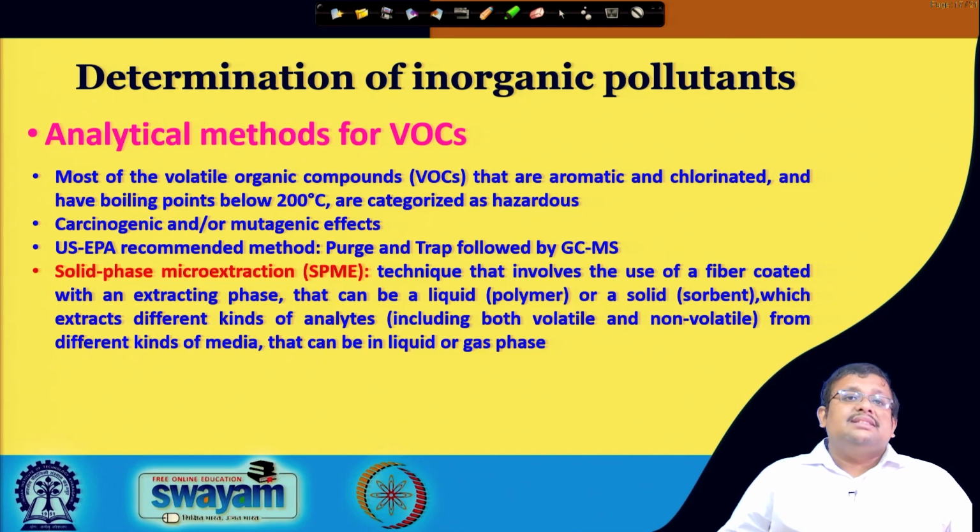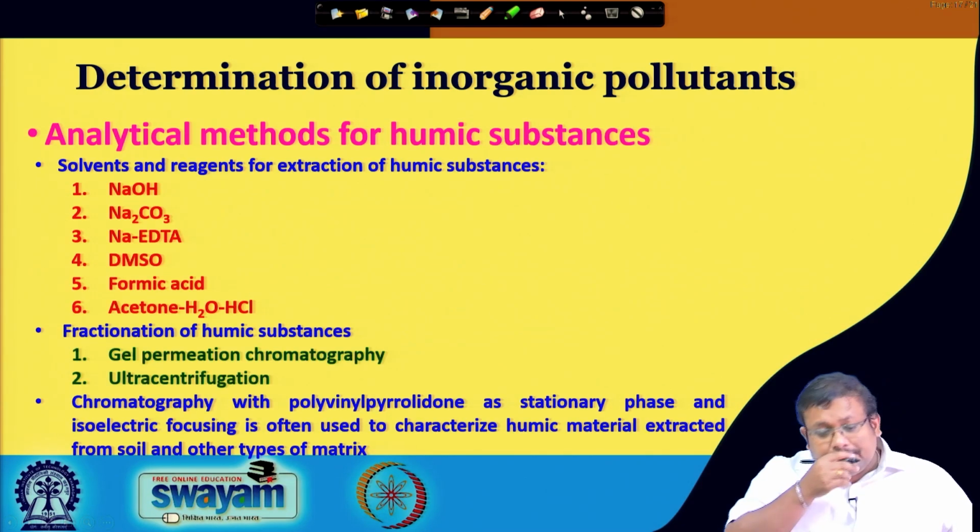Another technique is known as solid phase microextraction, or SPME, which involves the use of a fiber coated with an extracting phase that can be a liquid, polymer, solid or sorbent, which extracts different kinds of analytes, including both volatile and non-volatile, from different kinds of media that can be liquid or gas phase. So, these volatile organic compounds are also being analyzed in different types of environmental chemistry laboratories for detecting pollutants.